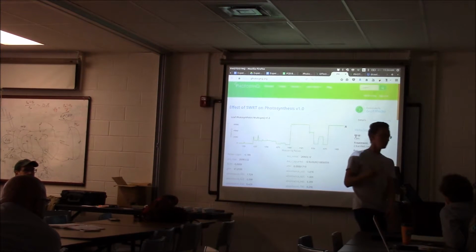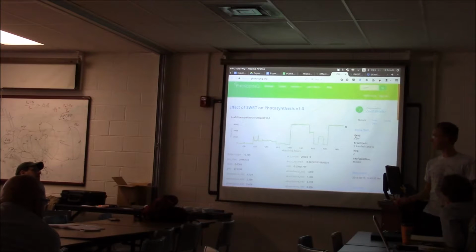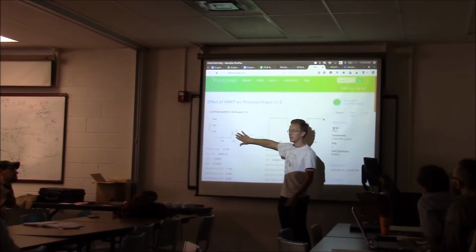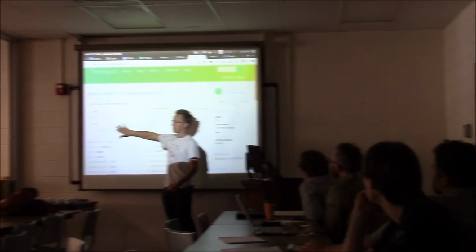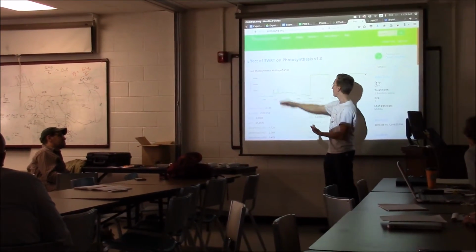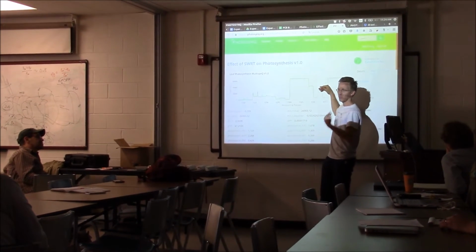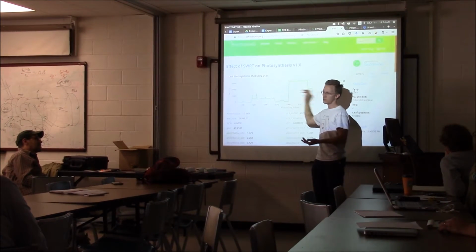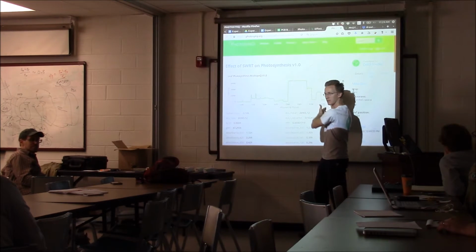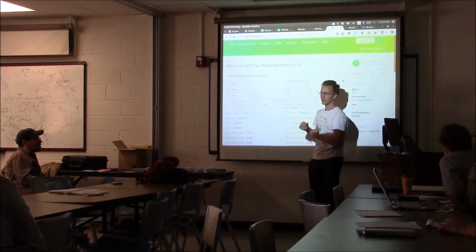We're doing that so if it's a very thin leaf, we have a low intensity so that we can measure a thin leaf. If it's a very thick leaf, such that a low intensity wouldn't actually get through the leaf, we do it at a very high intensity. And then we use the computer to figure out which one we should choose. So that's why we're doing 8 lights, but repeating it 3 times, so there's 24 total. That's what that piece is.